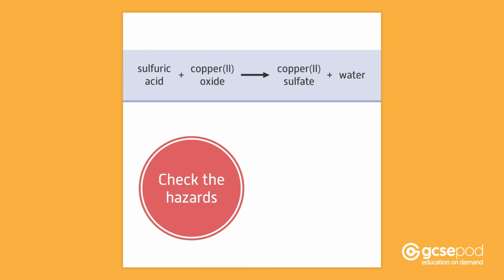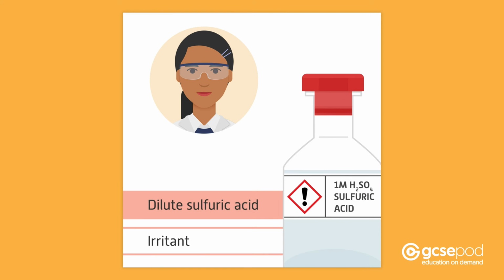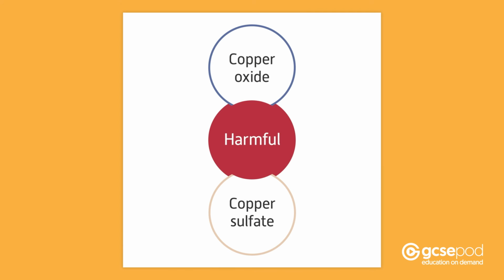Before you start any experiment, it's important to check the hazards associated with the chemicals you'll be using. The bottles will have hazard labels on them. Dilute sulfuric acid is an irritant. This means that you need to wear eye protection when using it, and any spills on the skin should be washed off immediately. Copper oxide and copper sulfate are both harmful.